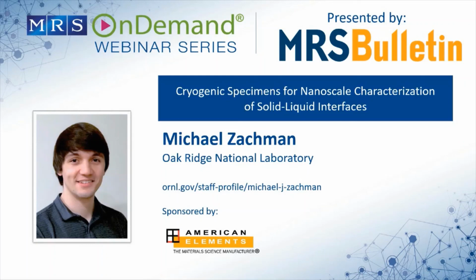Maybe they're talking about the FIB image of the lamella versus the EELS image. There are some larger ones that you can see in the FIB, and I think they are all bubbles all the way around. Some of them are larger, but some of them look less dark in the FIB because they're not cut on both sides, so they're not showing vacuum behind them in the SEM image.